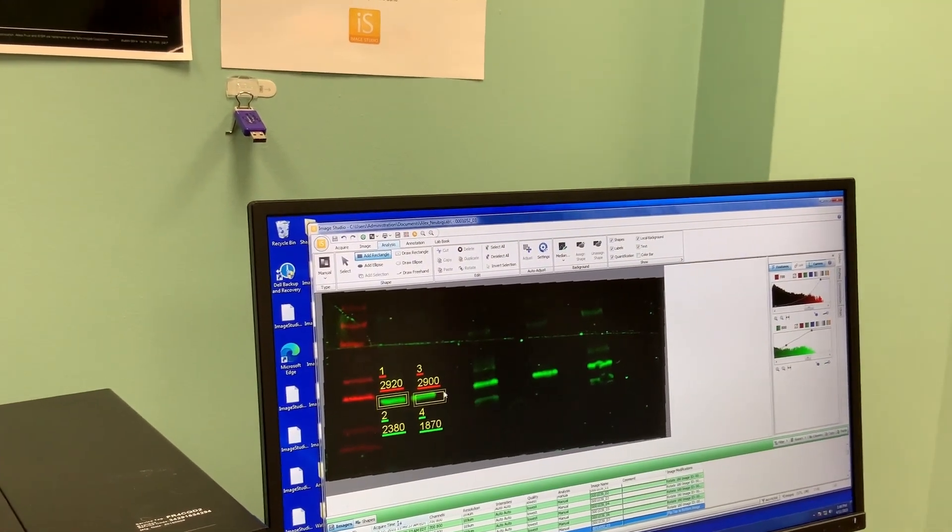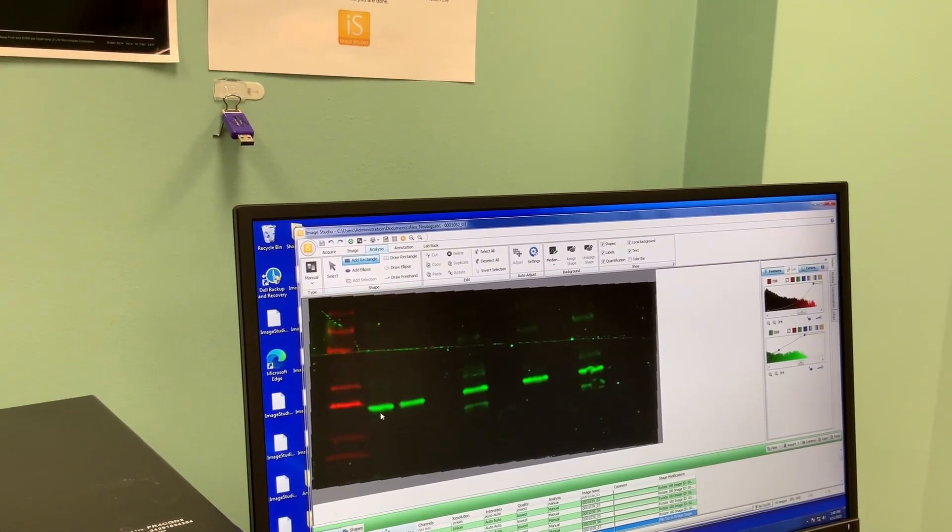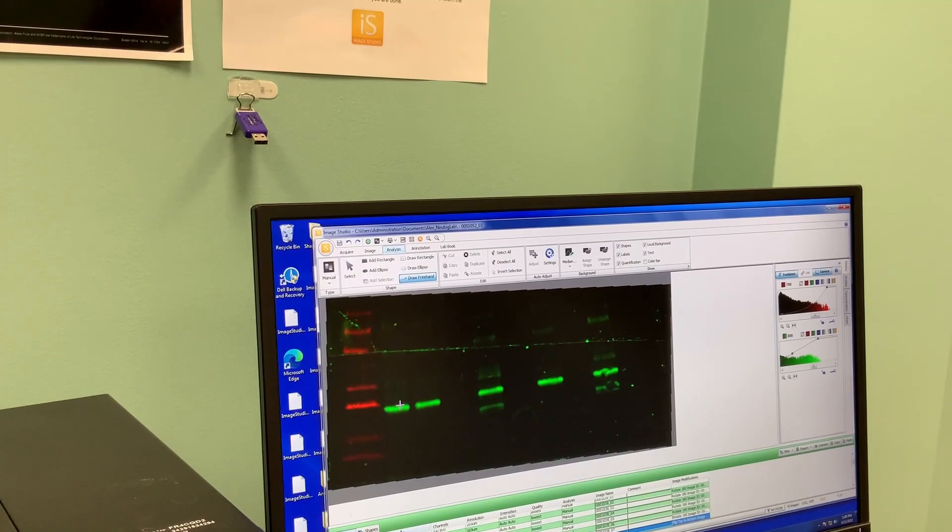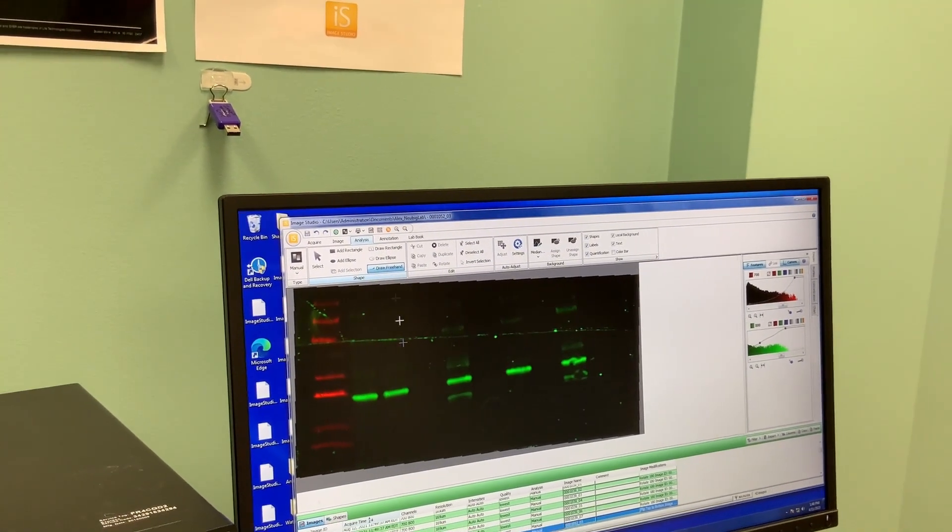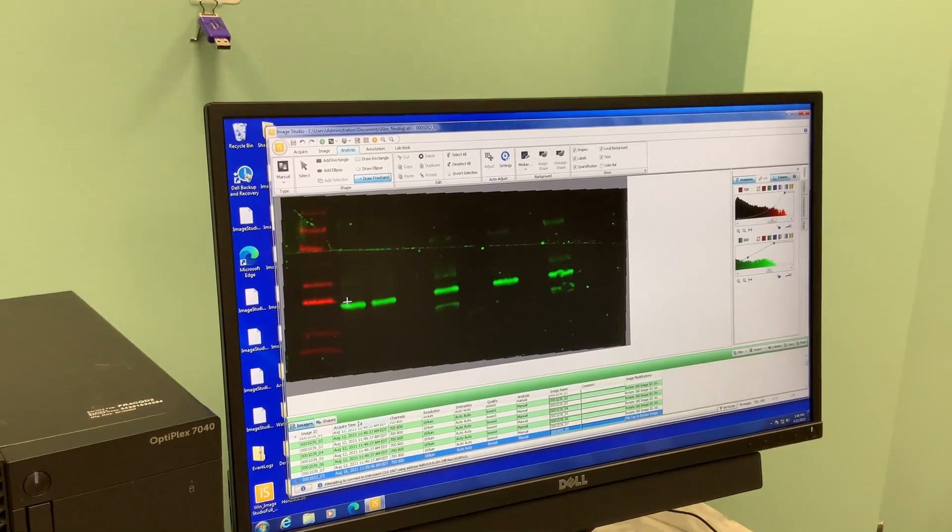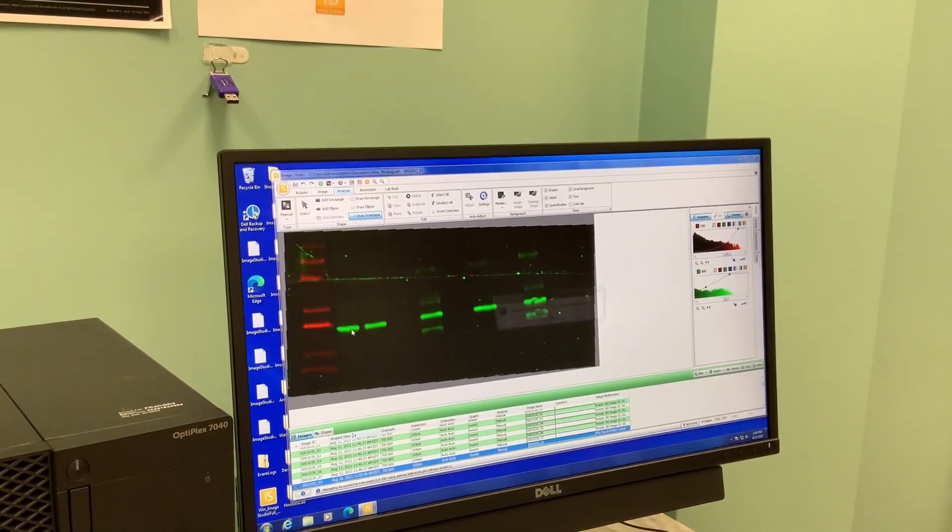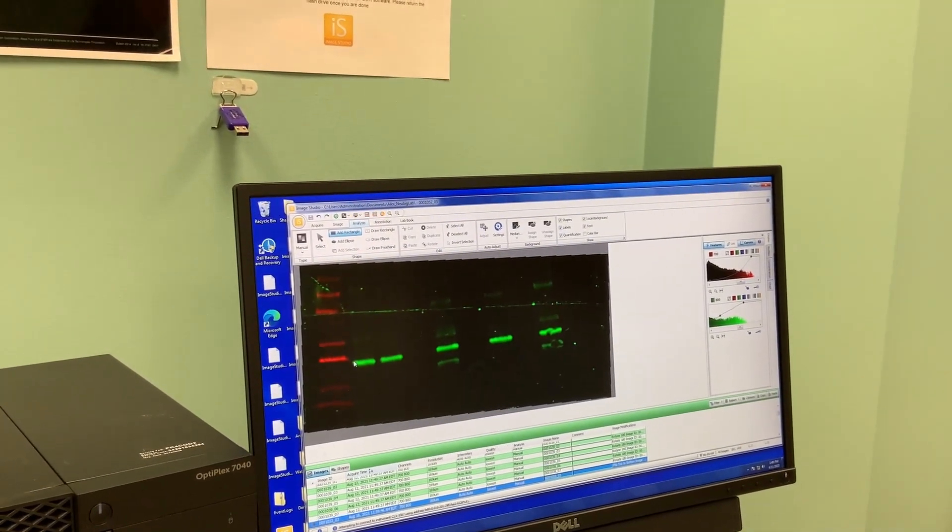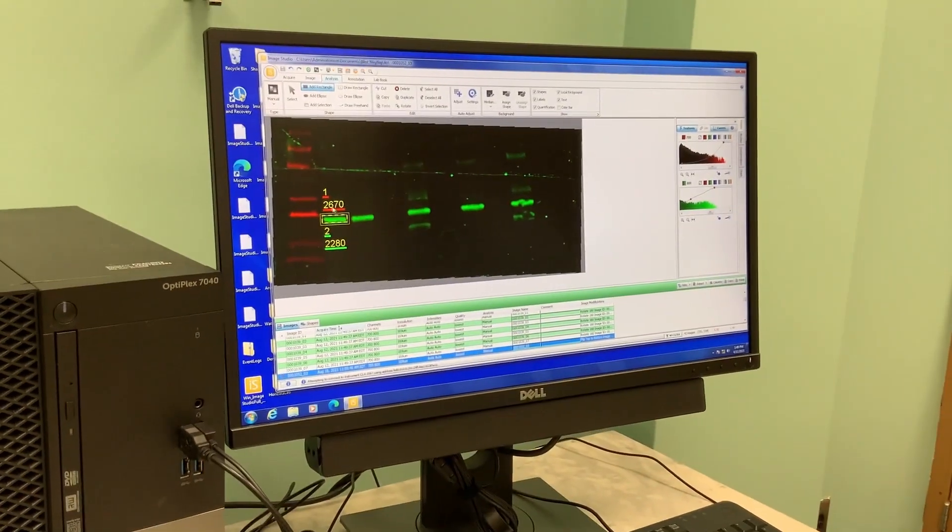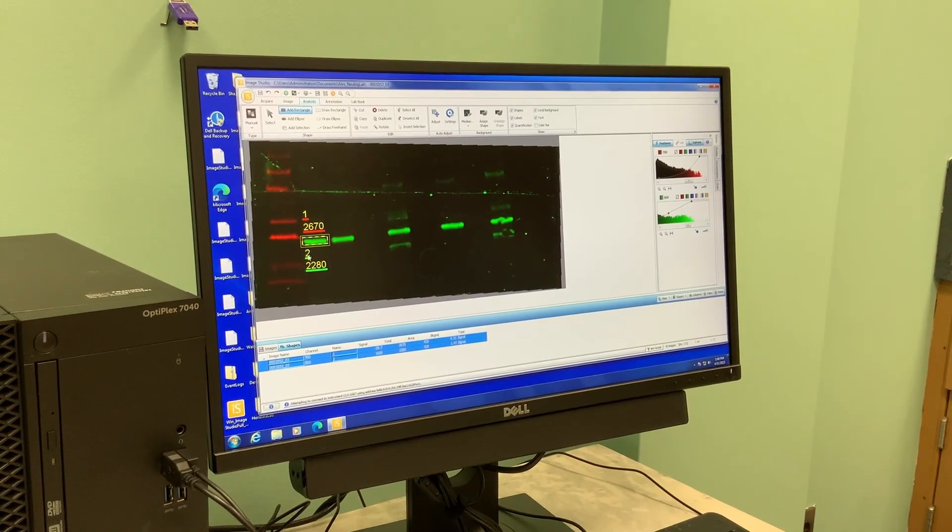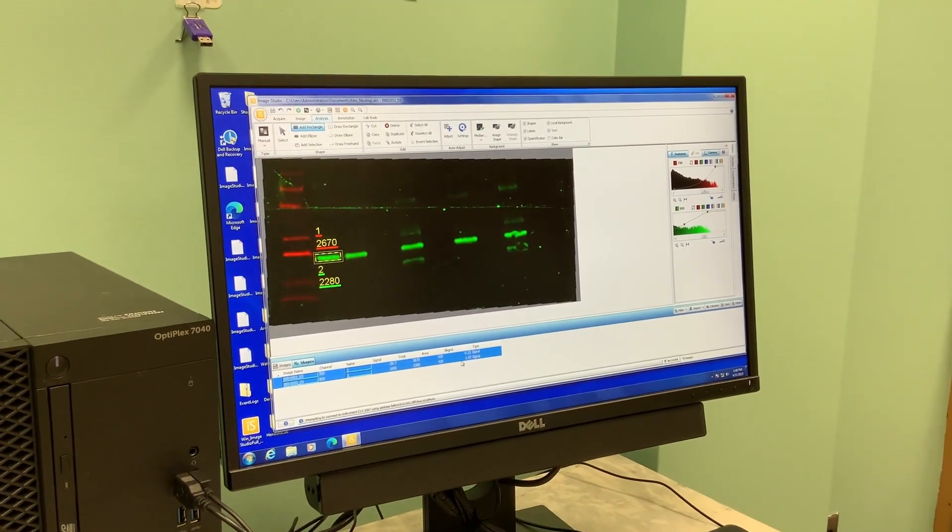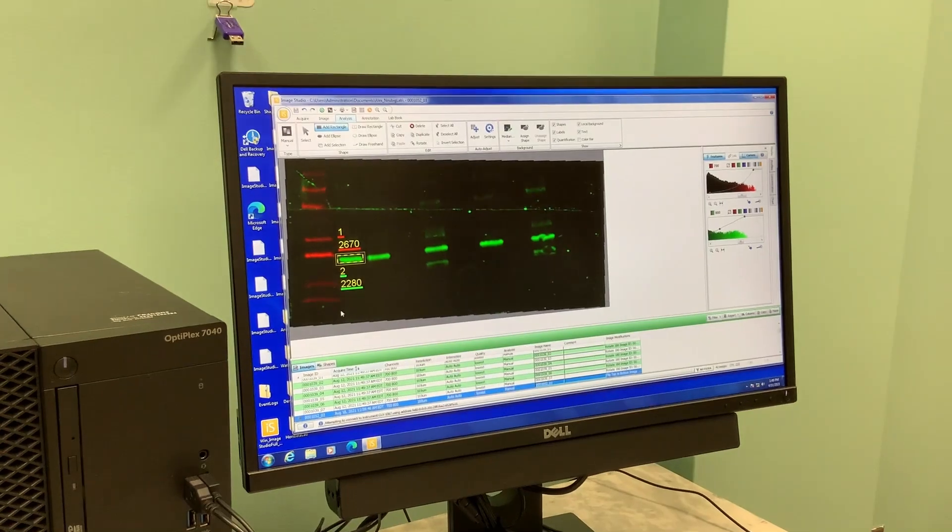Personally what I like to do sometimes, especially if my blot didn't come out very regularly, is I'll draw freehand. You can draw a freehand shape especially if your bands are kind of weird shapes. It will auto-detect the shape of the band and it has an intensity value for the red channel and the green channel. If we come down to the Shapes tab, it has my number one and number two shape, 700 and 800 channel, and the signal it calculates. You could do this across your blot to quantify and then copy that into Excel or Prism for data analysis.